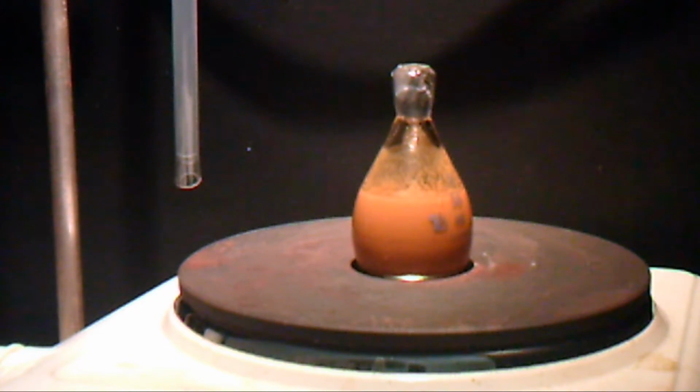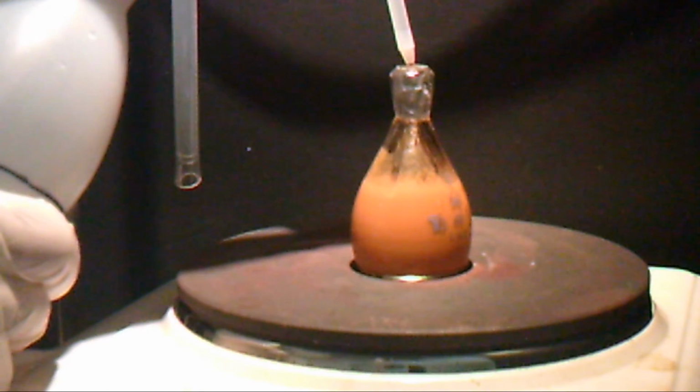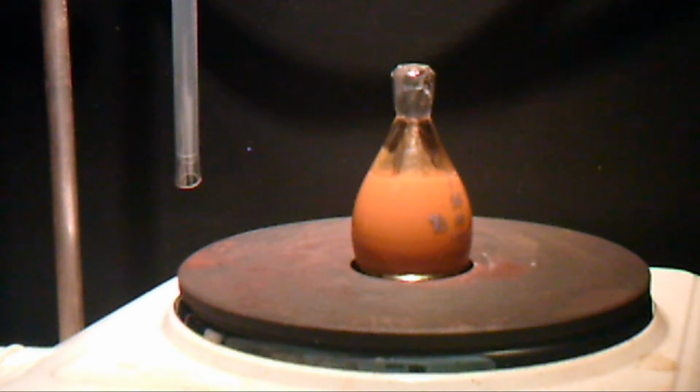The product is not soluble in water, which is very logical if you think about it, because from one side it is a salt, and from the other side the cation, which is our complex of copper with the 4 para-iodoanilines, has 4 benzene rings, and para-iodoaniline is not soluble in water anyway, so 4 of them must make the cation hydrophobic. So we have a hydrophobic cation, which is very interesting.